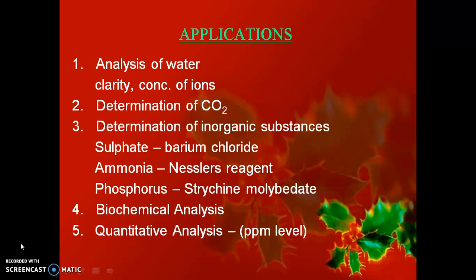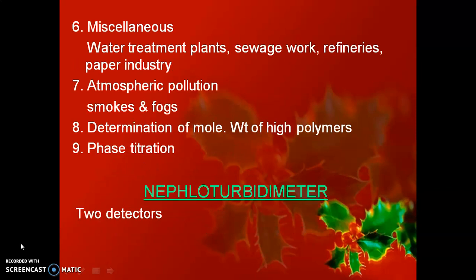In biochemical analysis also, this technique is very useful. For quantitative analysis, ppm levels can be determined using this technique. Bacterial concentration can also be determined in biochemistry.